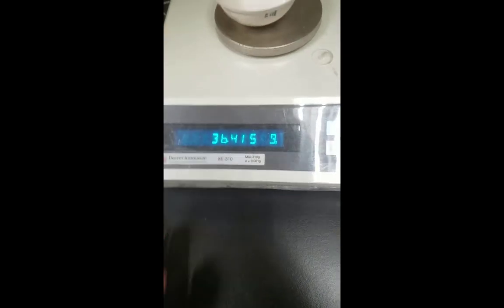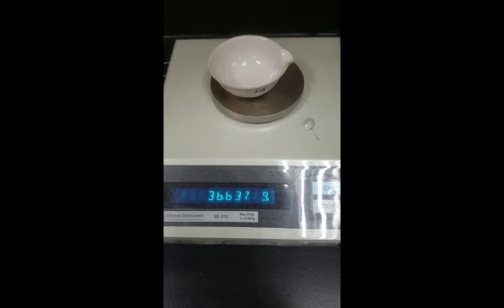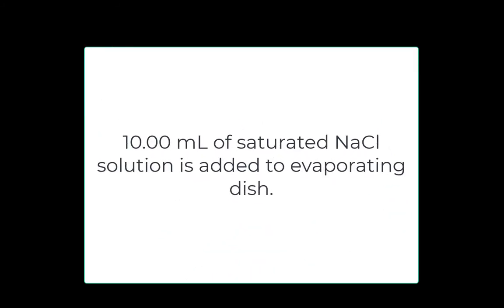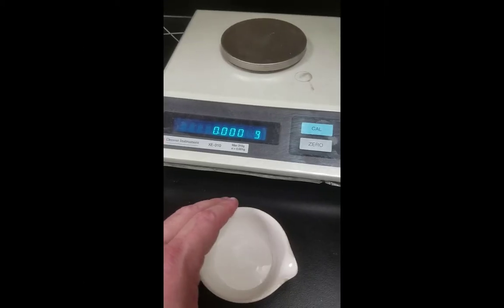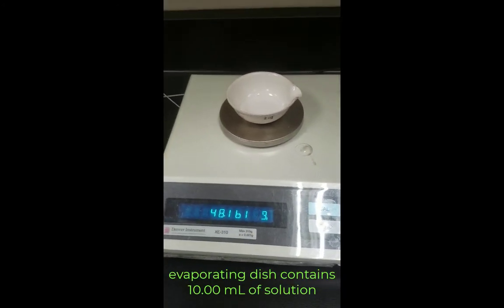I begin the experiment by weighing a clean and empty evaporating dish. At this point I added 10.00 milliliters of saturated sodium chloride solution — I do not have a video showing this process, you just have to take my word for it. Next, I weigh the evaporating dish that contains the 10.00 mL of sodium chloride solution.